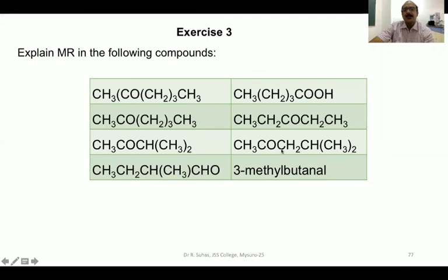So also this, and here in this case also, this is a substituted aldehyde. This is 2-methyl butanal and this is 3-methyl butanal. Both are isomers, no doubt, but by using mass spectrometry, you can easily distinguish between the 2 isomers, depending on the substitution pattern. Solve this by yourself, and if at all you have got any problem, then you can come to me on the YouTube channel for doubt clarification. This is about McLafferty rearrangement. Thank you very much.